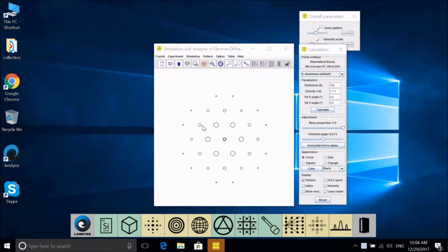If you have a multiple phase diffraction pattern as a composite in the display, the final proportion should be normalized. Just sum all the individual phase proportions and use the individual one to divide by the sum of that proportion.